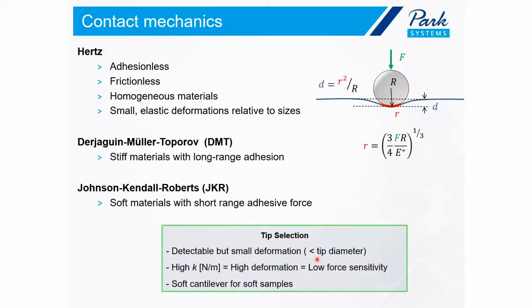The cantilever I was using was an SDR30. This had a starting tip radius of about 30 nanometers, but I have been using this for quite some time. So it might be even more, even a larger tip.